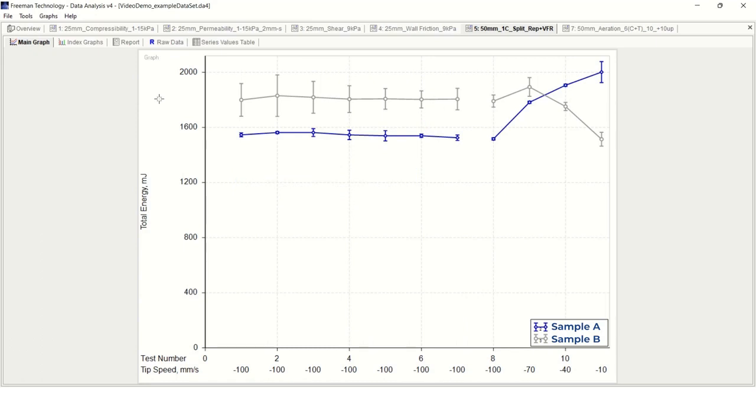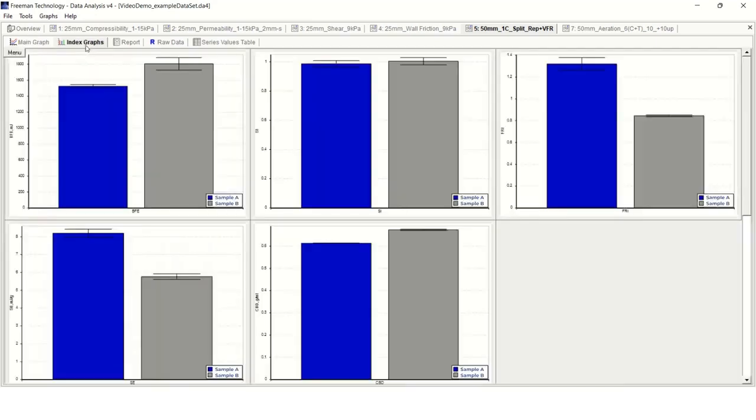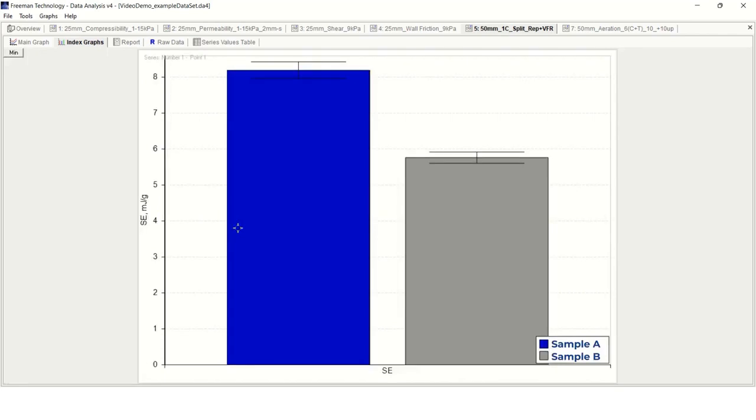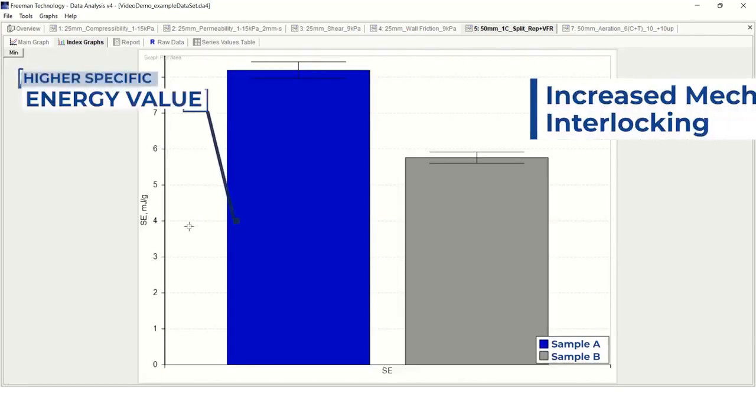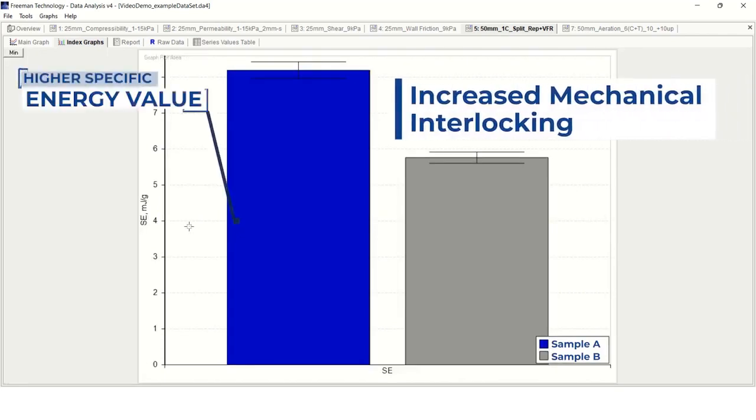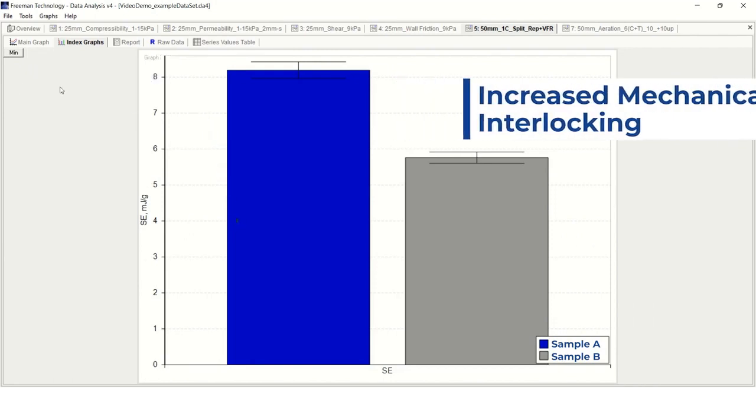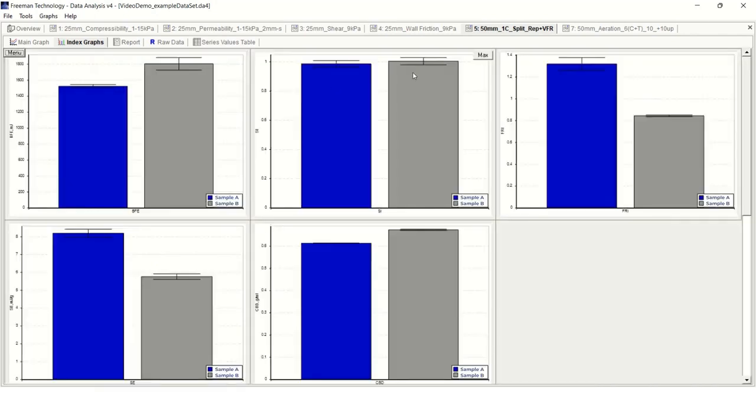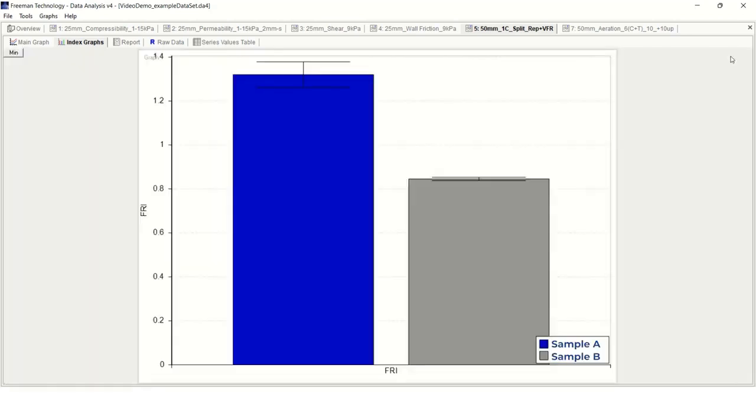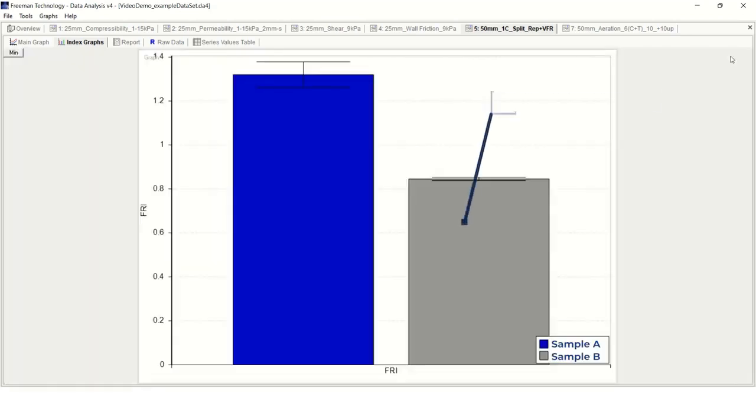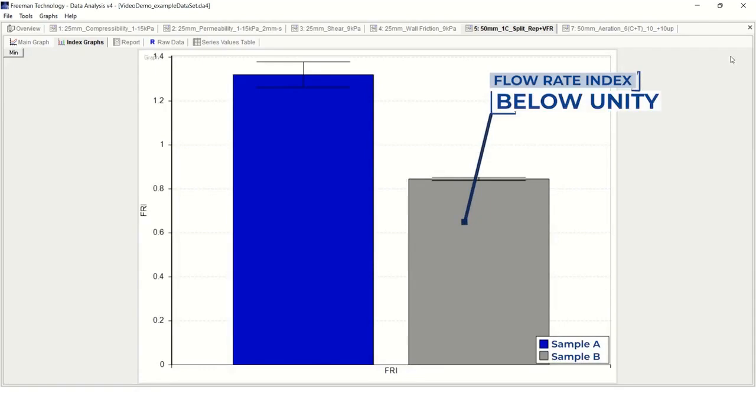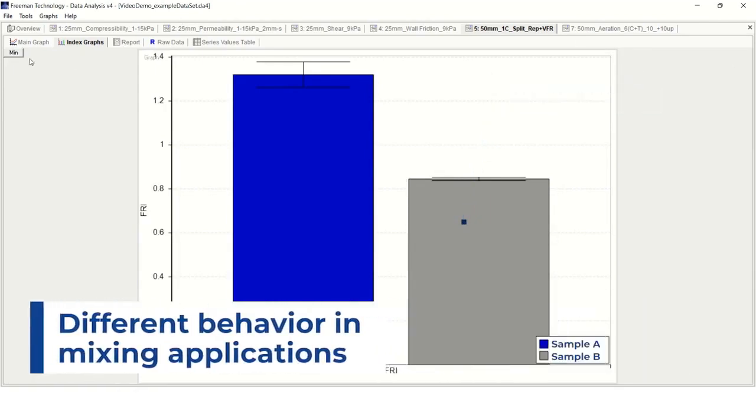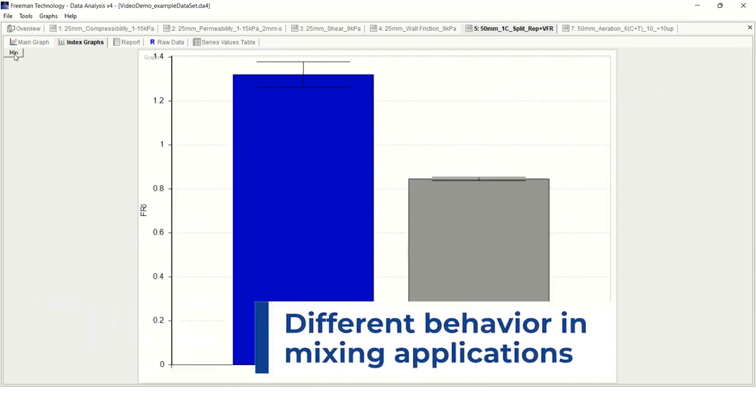We can also use the data analysis software to generate index graphs for each of the different powder flow parameters that are measured in this test. In contrast to these samples' BFE trends, we can see that sample A generated a higher specific energy value, suggesting that this sample has increased mechanical interlocking between the particles. We can also see that the two samples display differing behaviors in response to the changing tip speeds, with sample B generating a flow rate index below unity. This suggests that the two samples would behave differently in blending or mixing applications.